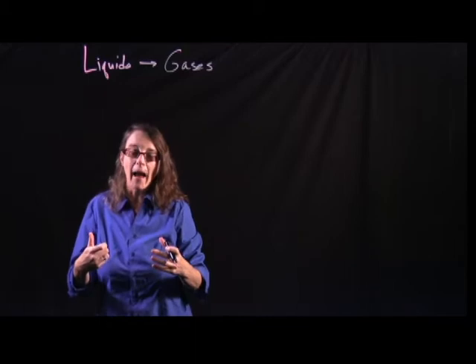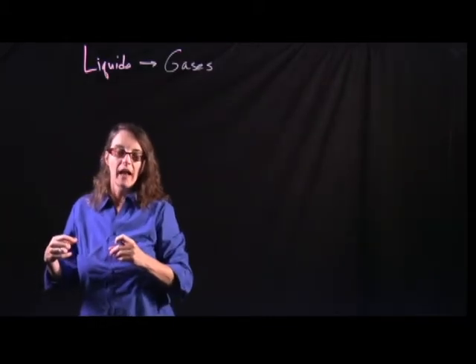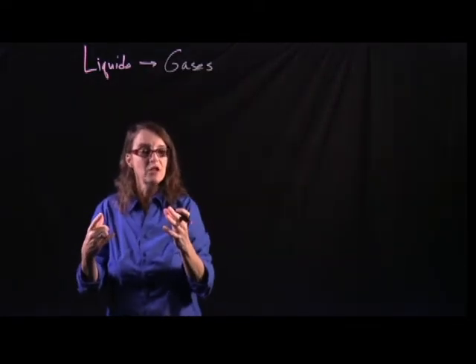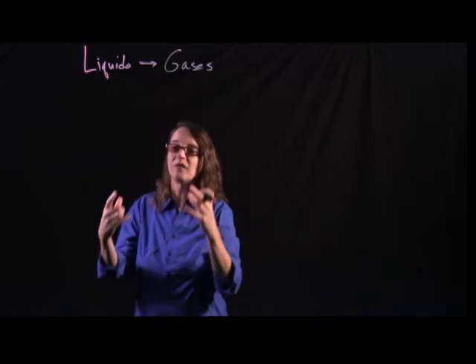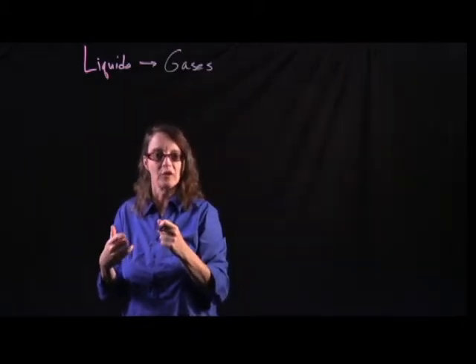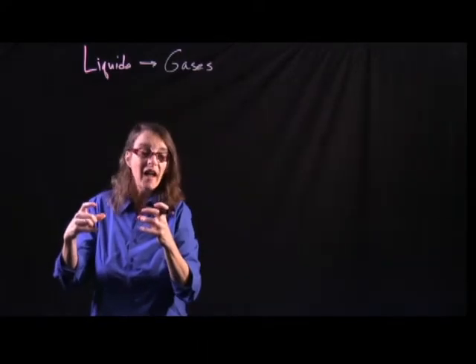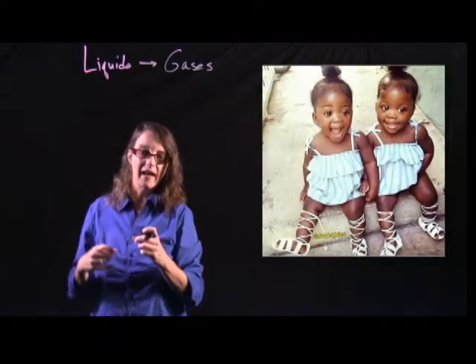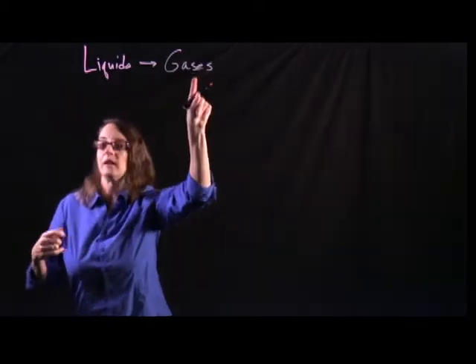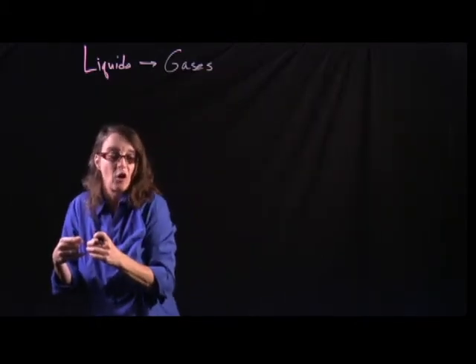So in this lab, we're going to be looking at molecular structure and how that relates to molecular geometry, what we see in 3 dimensions, and then how that affects the nature of the intermolecular attractions that these molecules have to their neighbors. When we look at molecules that are alike and the attractions they have to their neighbors, for example, when we're looking at liquids converting to gases or solids converting to liquids, we're looking at neighbors that are alike.